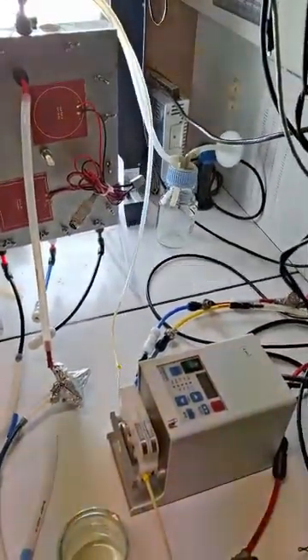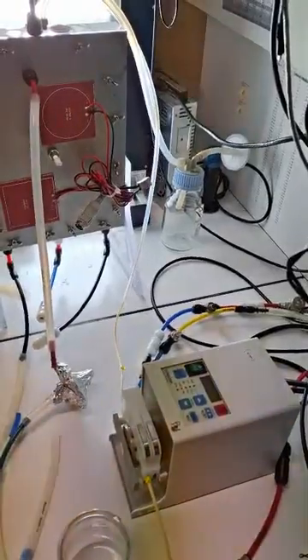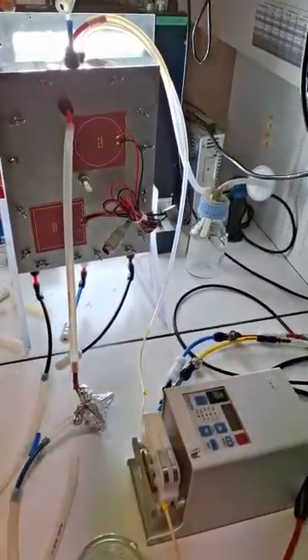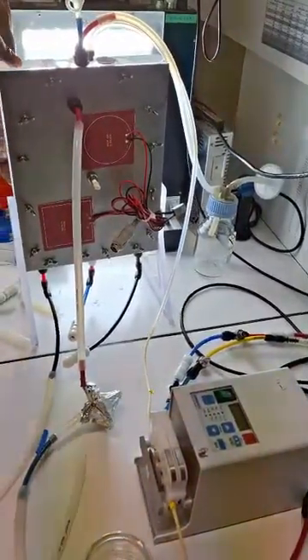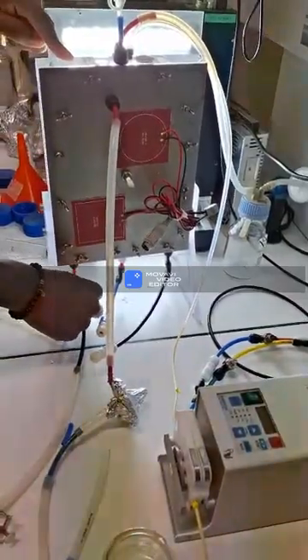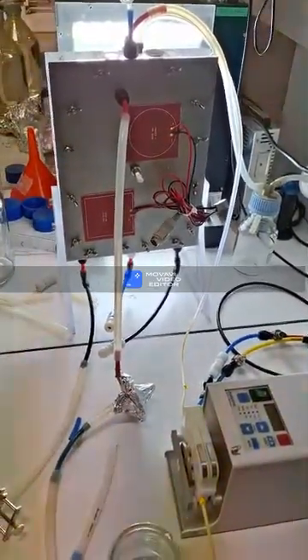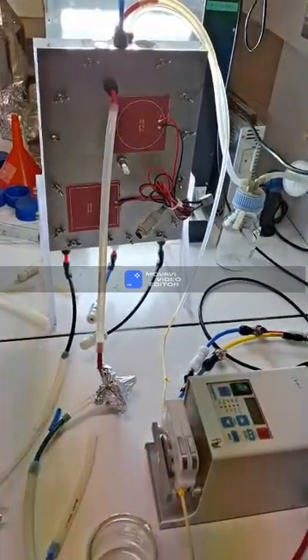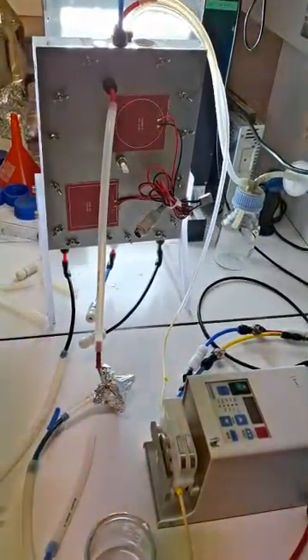So you can clog the filter and the air will not escape anymore. You will have an overpressure inside the PBR and you will have a leak. For example, a connector like this can disconnect and you will lose everything. This is why it's a security for the flow.